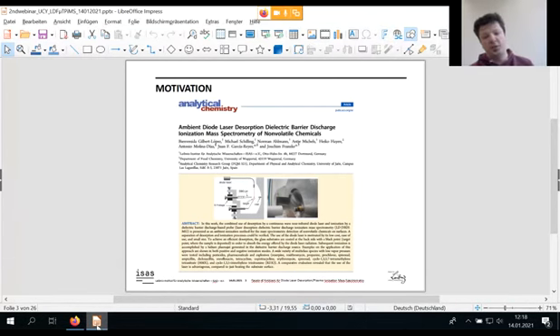So she used a diode laser, an infrared laser by the way, and shot it on a microscopic slide, a glass surface. That glass surface was doped with black ink dots. So she used a pen and dotted the glass surface. It was already almost 10 years ago, so it's been quite a while since then.